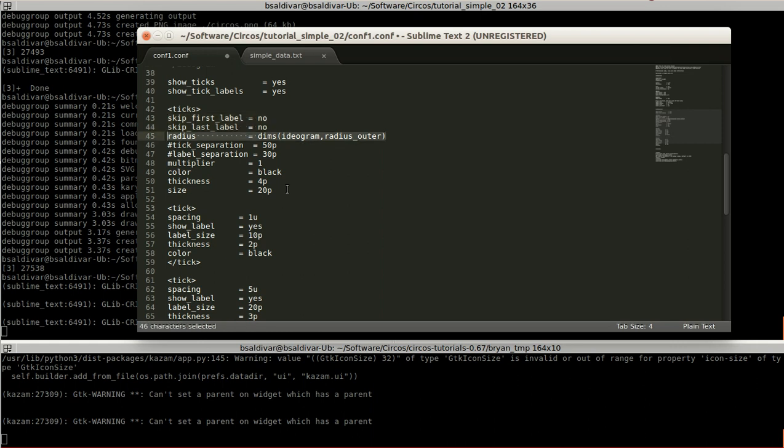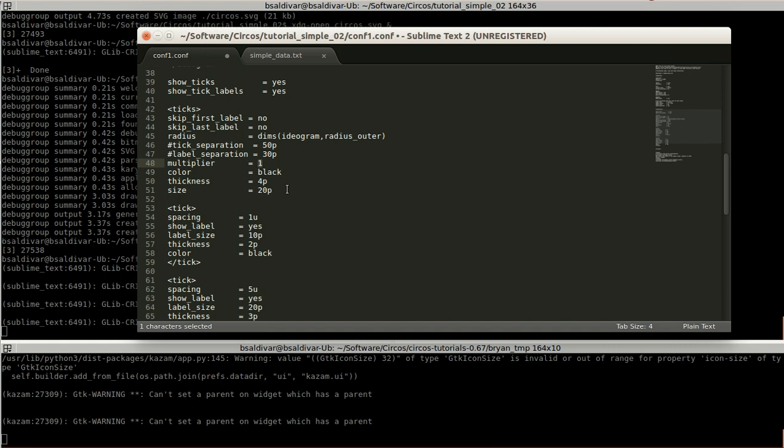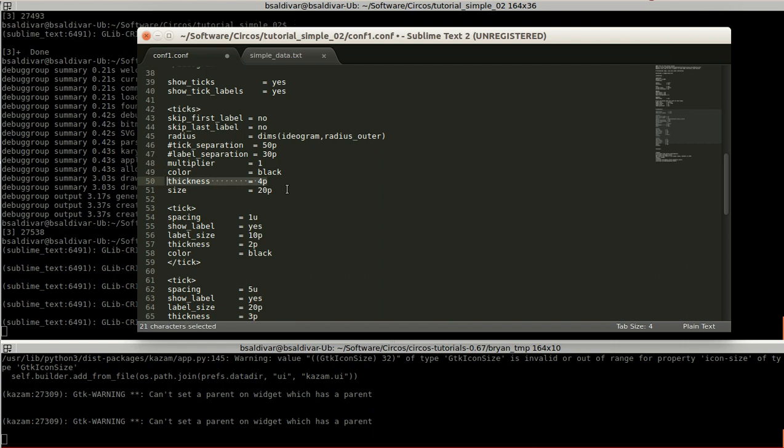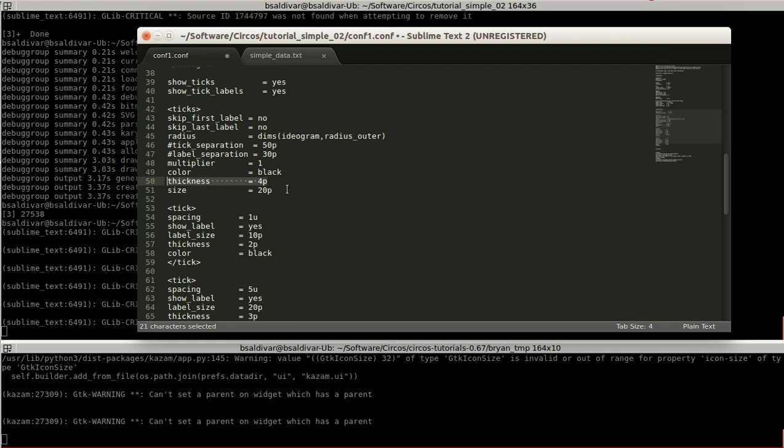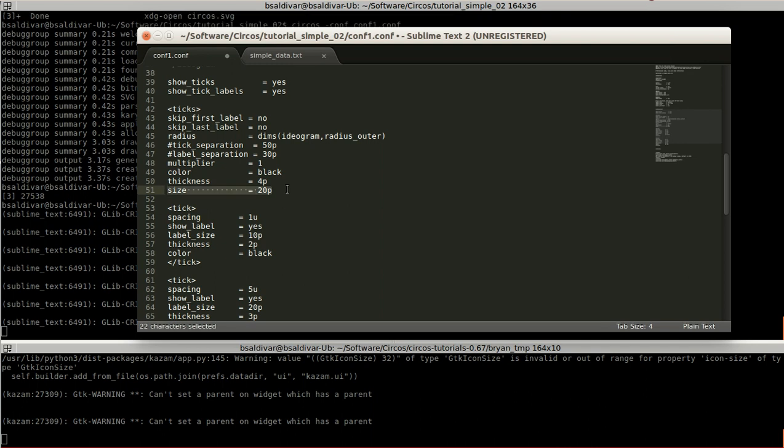So these first two lines represent if we are going to show or not the first and end ticks of each karyotype. This is going to be the radius, we will leave it for default. And the multiplier here is going to be the number that appears at the label of each tick. So we will modify this later. But if we set to one, each tick is going to represent an increase of one unit. If we set to two, each tick will show a multiple of two. This is the color, how thick the ticks are going to be, and the size that each one of the ticks will have here.